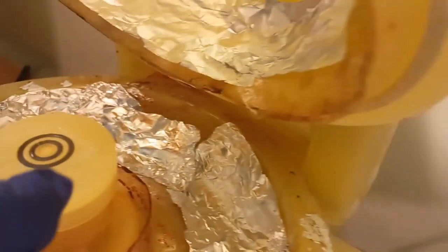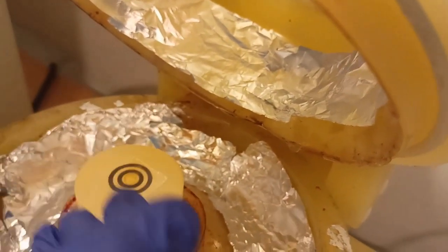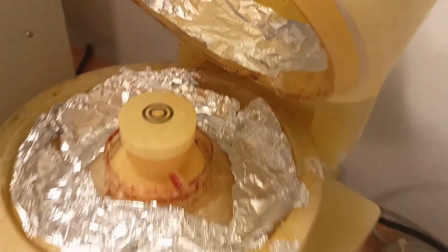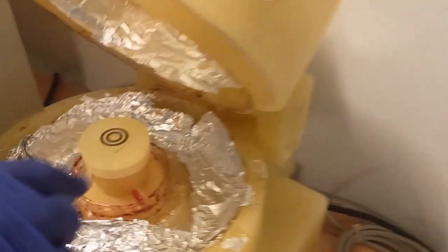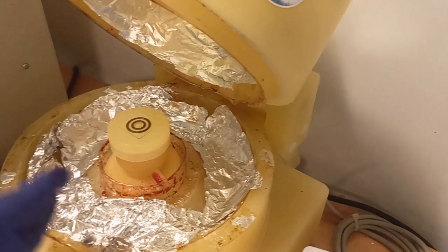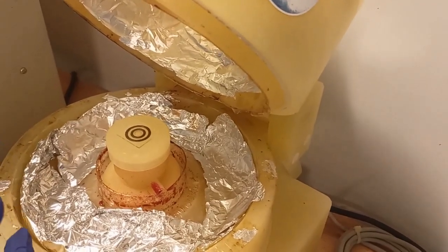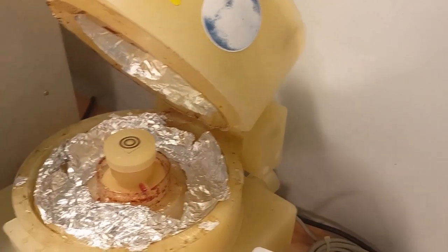Now I am putting it on this chuck. On this chuck, you can see two circular rings. These are mainly to hold the substrate. I am switching on the vacuum, so vacuum is applied to hold the substrate. Otherwise, when we apply angular speed on this chuck, it may spread out. So to hold it, we need something, in our case vacuum, and it will hold very well.